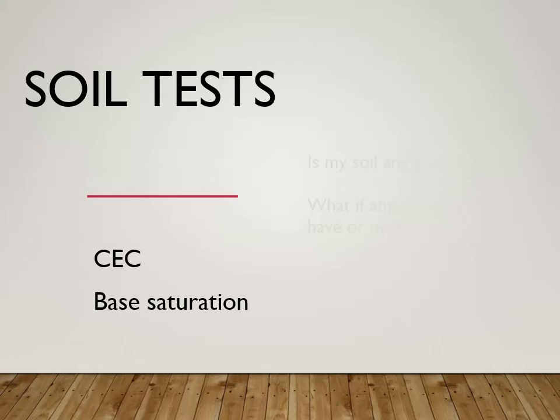Okay, so in this lab demonstration, I want to go over two tests that we would look at in a soil test. We've already discussed cation exchange, so CEC, but what I want to talk about is base saturation as well. So I'm going to introduce you to that concept.